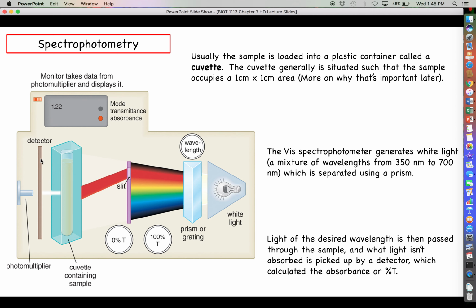So we've already established that visible light, meaning the light that our eyes can actually see, falls within a pretty narrow range. Everything from 350, which is going to be the deep, deep purple colors, and then up to 700, which is going to be the very dark red colors. Everything in between, you'll notice, is the blues, the greens, the yellows, the oranges, the reds, and so on.